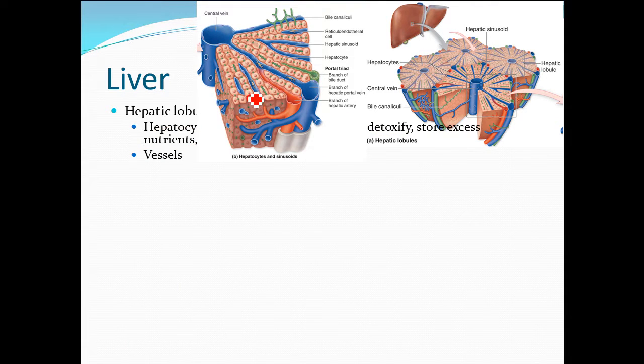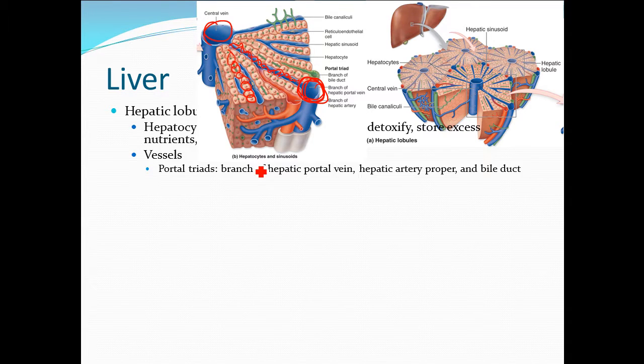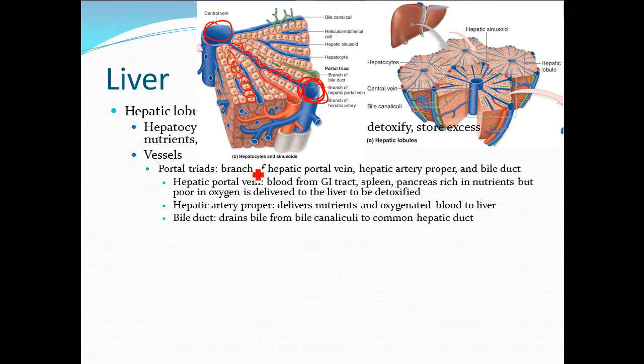So these are, once again, what kind of cells? Hepatocytes, okay. What was this structure called again? The hepatic portal vein, or the venules, right? And this passageway, sinusoids to the central vein. So some of these you should already know, right?